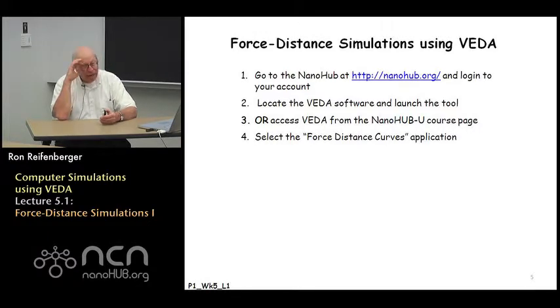And the other thing I'll say is it's not clear how to step through these simulations. There's an issue about whether we want to try to do them in real time or whether we want to capture the important results using screen capture. I've settled on the second approach, and I've annotated the screen capture with numbered bullets that describe important features.